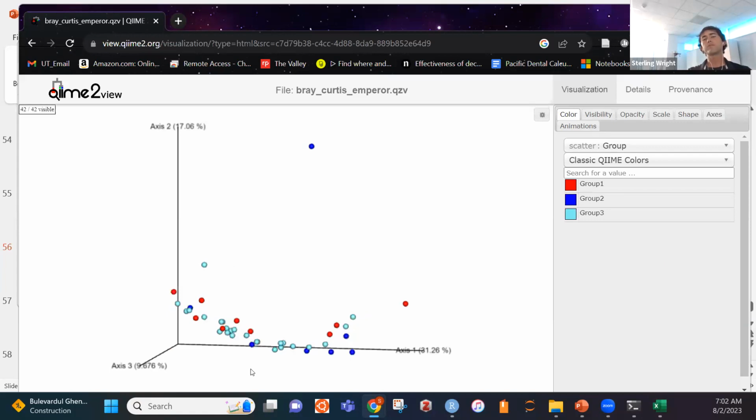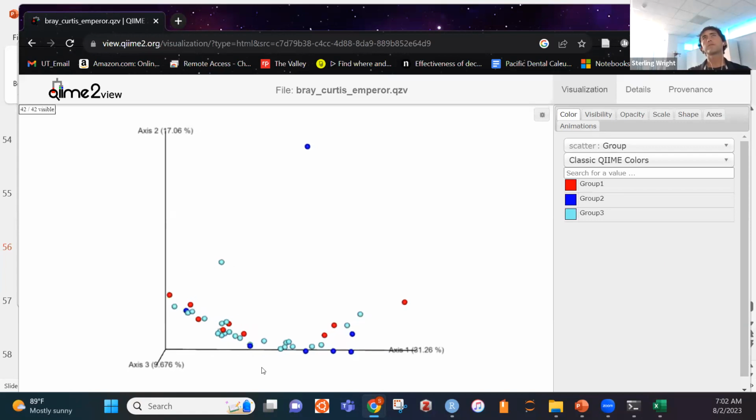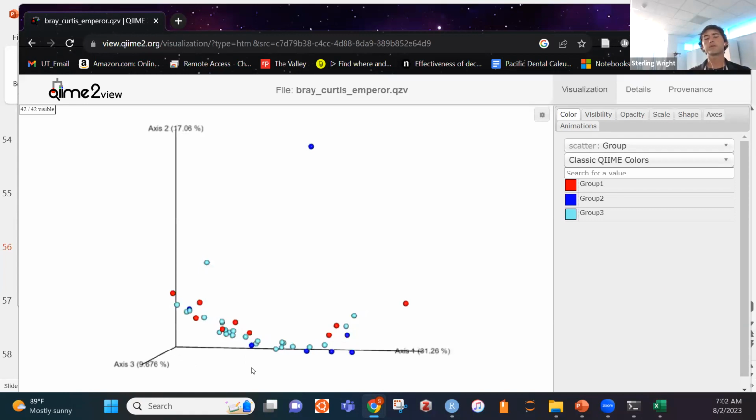Does anyone have any questions about PCoAs or anything up to this point? I know I've been flying through QIIME 2 right now.